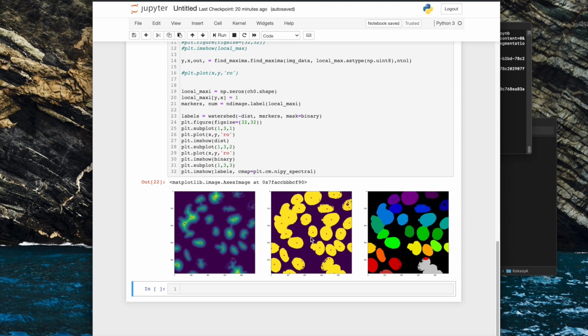We could always exclude cells like this if we thought they were problematic, but as long as one condition isn't biased by the analysis compared to another, then it's all right to have some error, because all of imaging and analysis is an interpretation of what's really going on rather than the exact truth. So as long as your conditions are not being biased by your analysis in one way or the other, as long as it's kind of not perfect across the board and to the same extent, then it's still a good experiment. So we'll proceed with the analysis as it is.